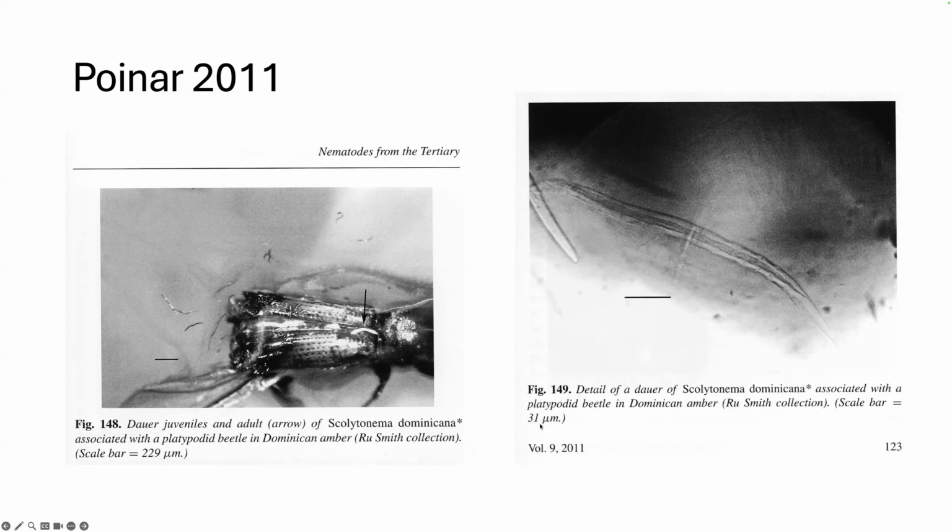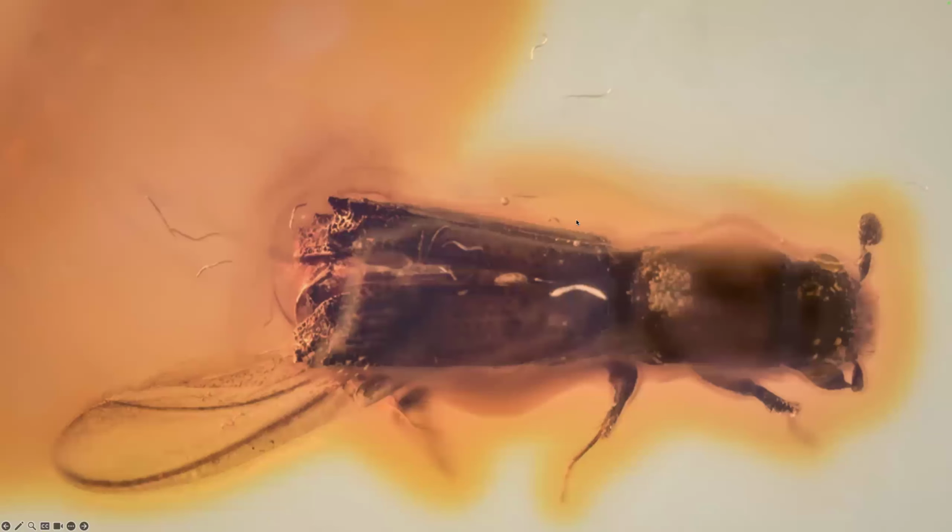So that is about a third of the width of a typical human hair. So the whole nematode there is the length of two human hairs laid side to side. If I remember right, a human hair is typically 60 to 120 microns across, something like that. So very, very tiny. And it's quite a dramatic image, but at a really tiny scale.